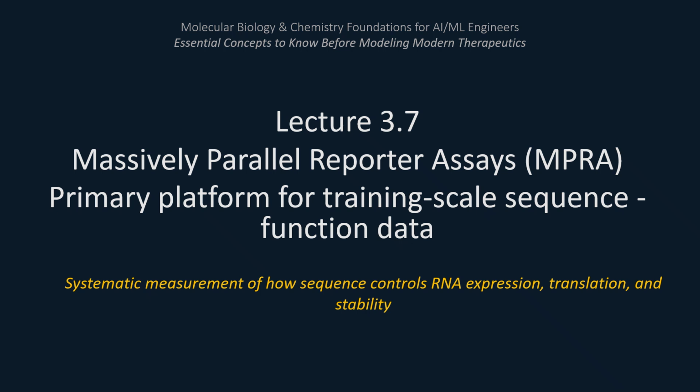Okay, so let's focus on massively parallel reporter assays in this lecture, MPRA. So this MPRA lets us measure the functional effects of thousands to millions of sequence variants.